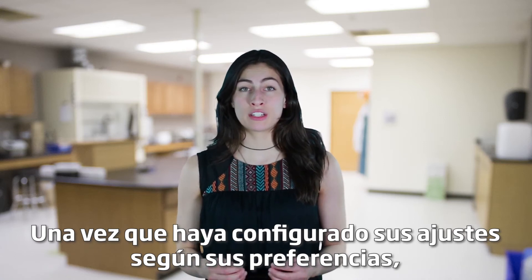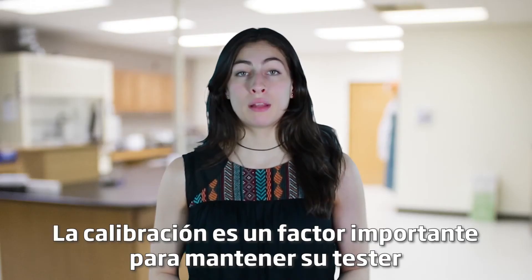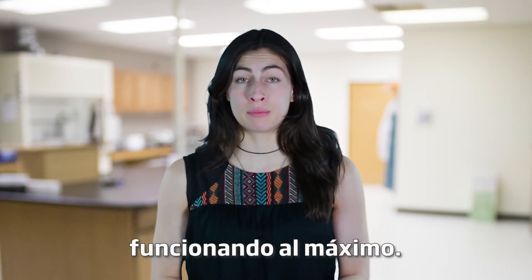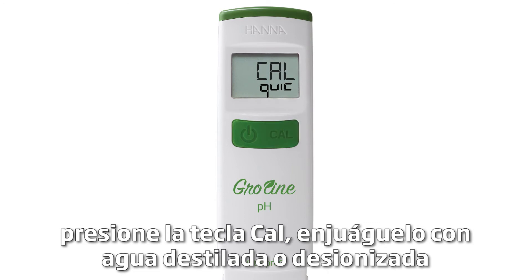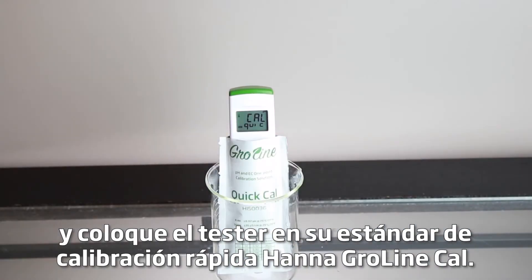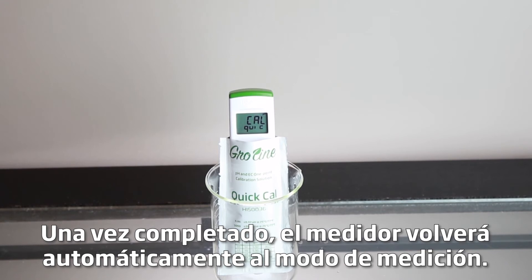Once your settings have been set to your preference, the tester is now ready to be calibrated. Calibration is an important part of keeping your tester operating at its best — we recommend calibrating before each use. To calibrate your tester to one point, press the Cal key, rinse it in distilled or deionized water, and place the tester in your Hanna Growline Quick Cal Calibration Buffer. After it's complete, the meter will automatically return to measurement mode.